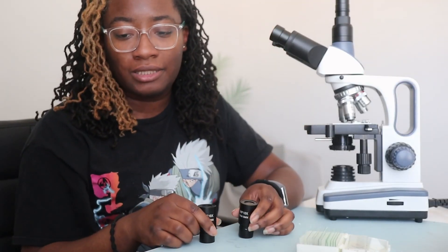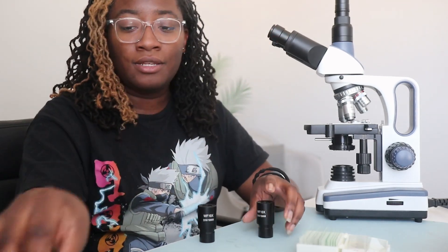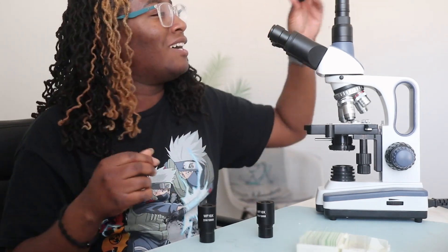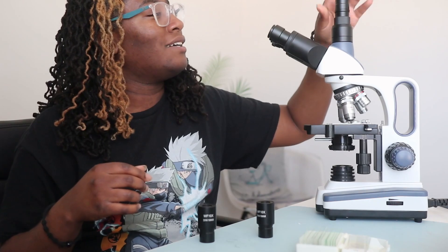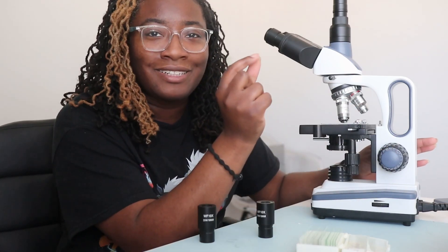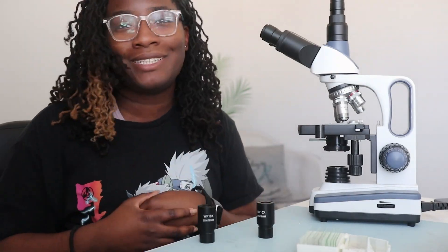Overall, I think it is a nice microscope with really good quality and I don't foresee any issues with the actual microscope. The logistics are just something I need to figure out on my own. The only thing I would change is the coarse and fine dial — I feel like it's overcompensating, so every time you turn it, it turns just a little bit more. It makes it hard to get a clear image, as you can see in the footage I showed. Other than that, it's a pretty nice microscope and I can't wait to get started using it.